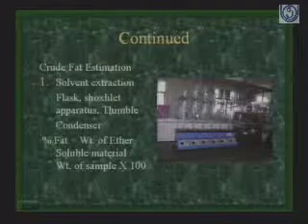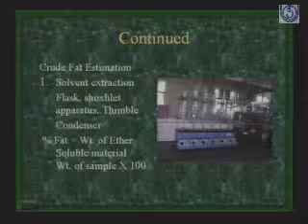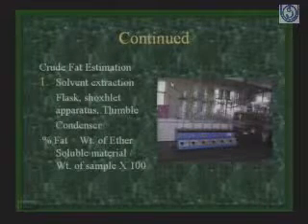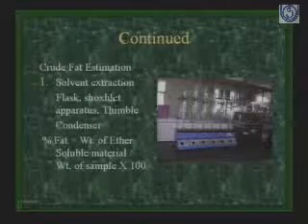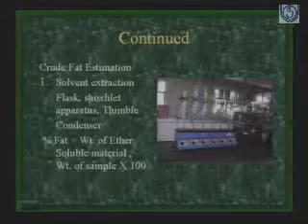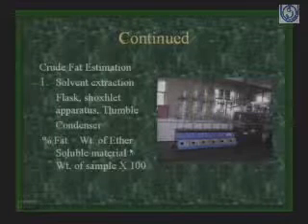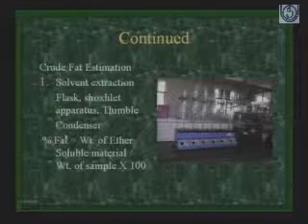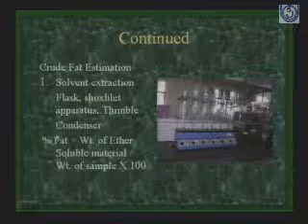And then once the fat is completely soluble in the diethyl ether and has come into the flask, you take it out. Once you take it out and take the weight of the flask, it can be calculated: the percent fat is equal to the weight of the ether soluble material divided by the weight of sample you have taken, into 100, which indicates the percent fat in the food product.